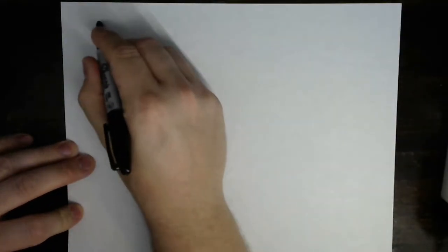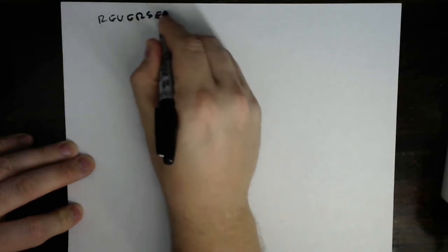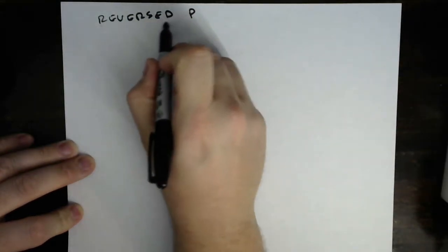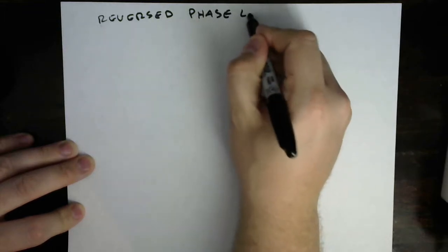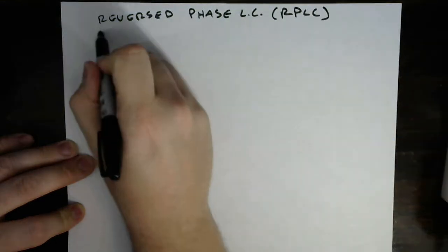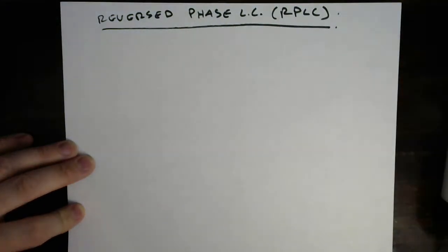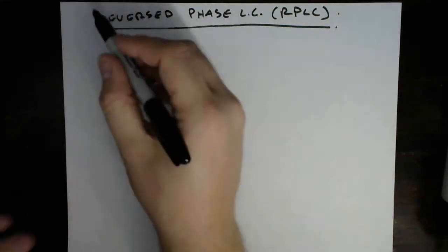Okay, next mode of partition chromatography is what we call reversed, or reverse. Some people leave that D off. Reversed phase liquid chromatography, or RPLC. As I mentioned before, a lot of folks just think of this as synonymous with HPLC because it's the most common mode of HPLC.